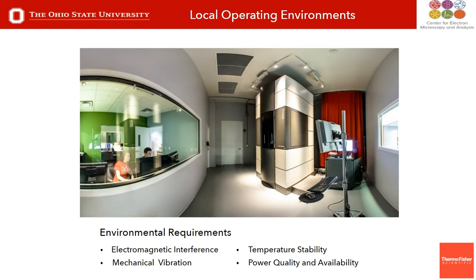Our users sit outside of the rooms of the microscope so that they don't disturb the microscope and the data collection in-house. And in order to do that, we had to figure out a way to utilize the microscopes with almost zero latency. And in that process, we figured out how to do that across the continental United States rather well, and we can even span the Atlantic and the Pacific.